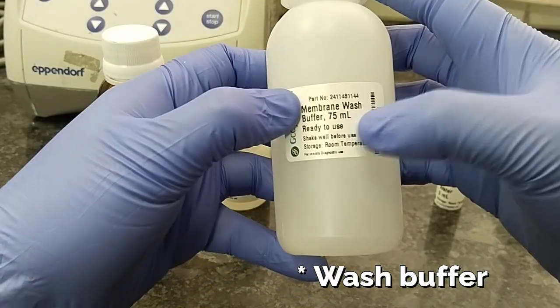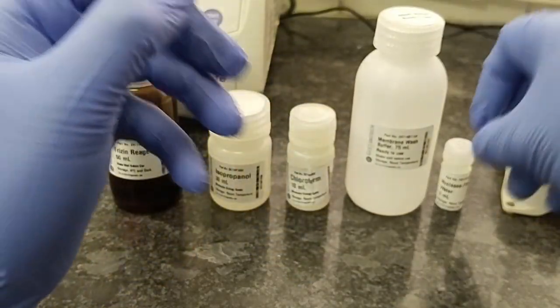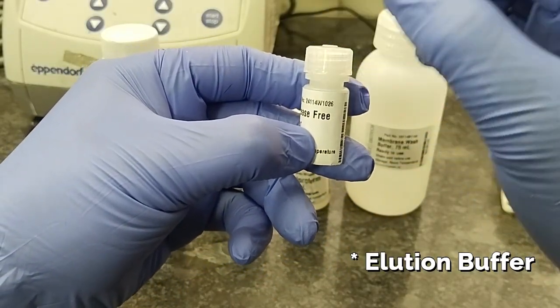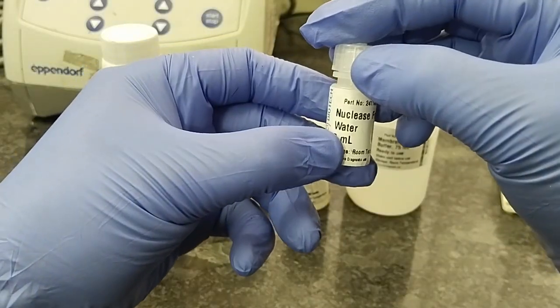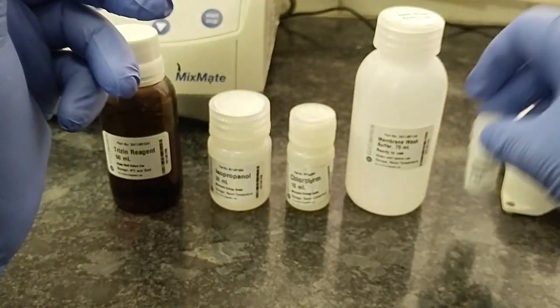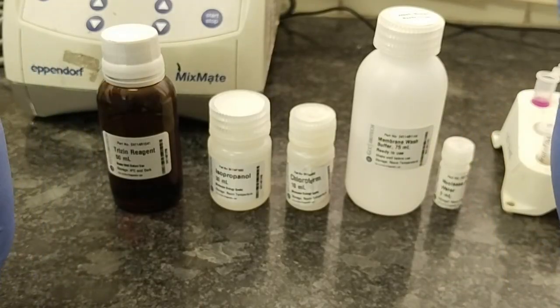Fourth reagent is membrane wash buffer. Membrane wash buffer is used for the washing purpose. It contains ethanol. And the last one is nuclease free water. It is used as an elution buffer. We have to elute the RNA from the column once it is extracted. So nuclease free water is used for elution purpose. So the kit contains a total of 5 reagents. By using the 5 reagents, we can extract the RNA from any sample.